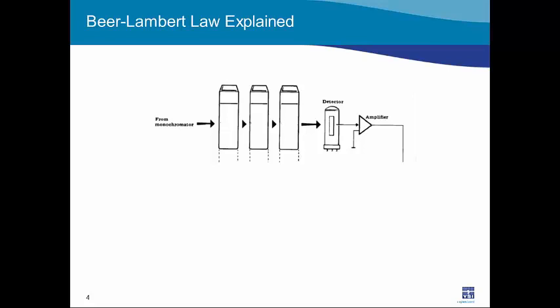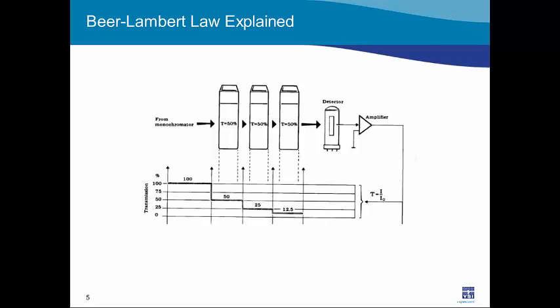The other principle is then Beer's law. And Beer's law states that the intensity of light decreases exponentially as the concentration of the sample increases. So in this example, if we had, say, 3 standard concentrations, and we carefully selected those 3 standard concentrations, so each successive standard absorbed 50% of the light as the preceding sample.